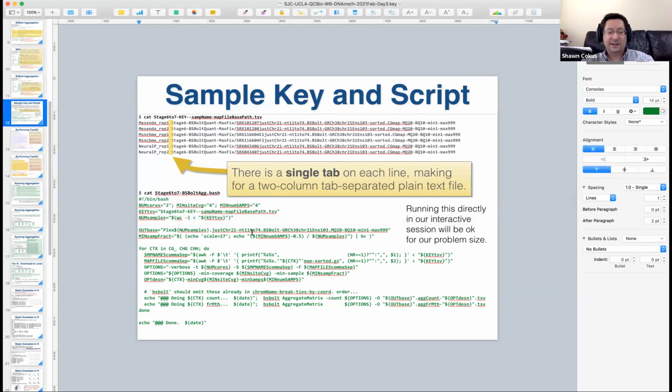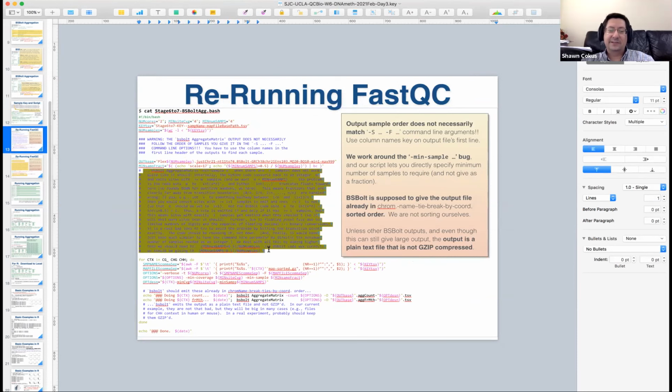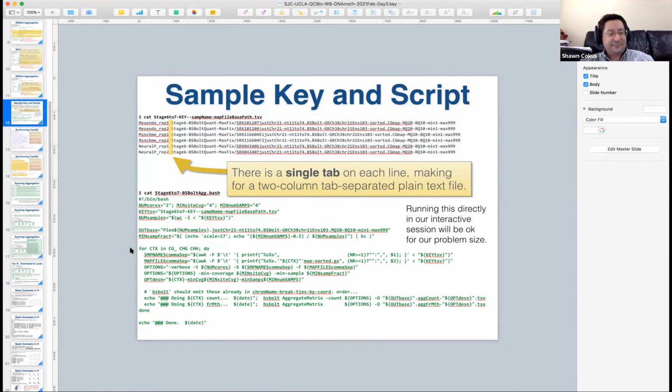But based on the documentation for what the interpretation of that parameter is, that's not what you're supposed to have to do. But okay, the fix is going to be simple. The little plus sign here. Describing the fix is going to take all these words, right? So that's the comment that kind of says all that, but the fix is really a 1-character workaround, right? So that minus becomes a plus.